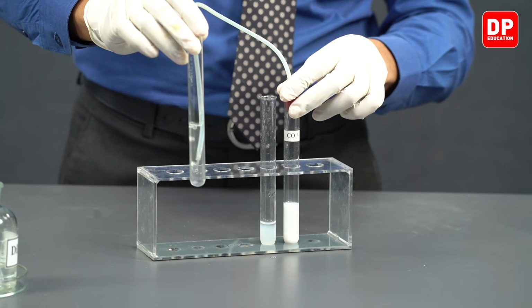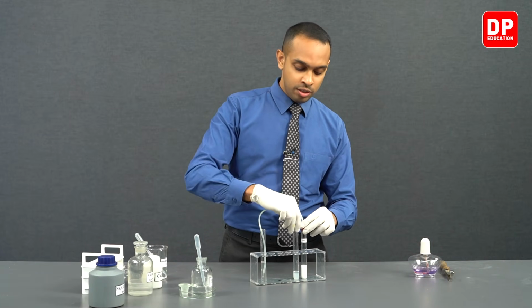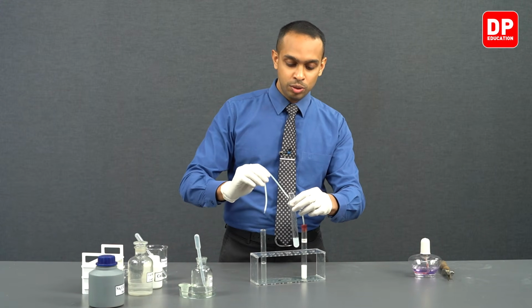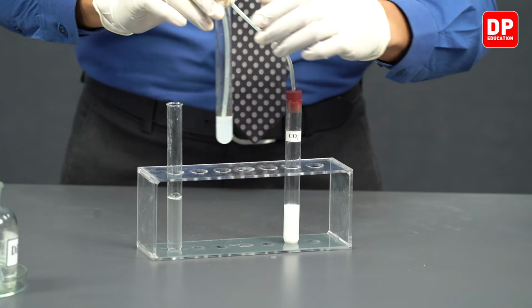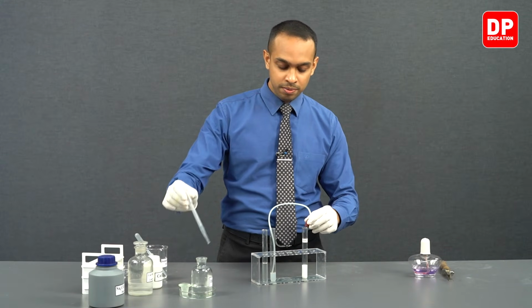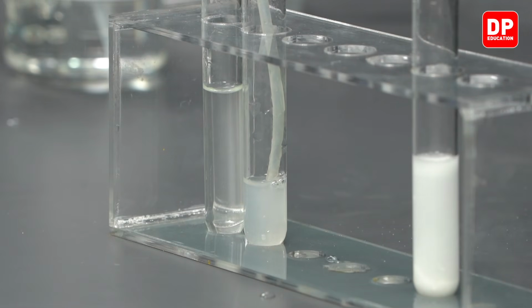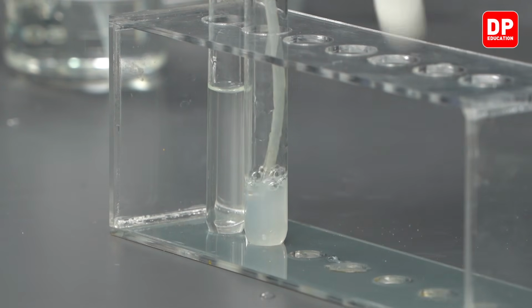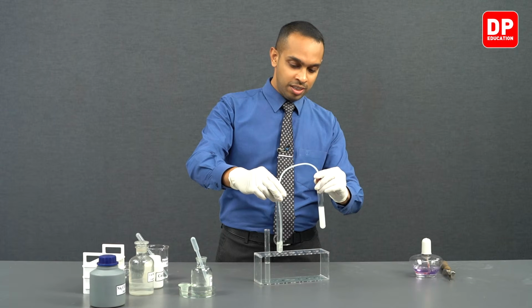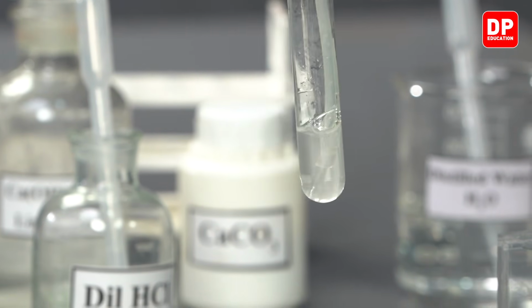We can very clearly see that this solution has turned clear as well. So we'll take the last portion also and attempt to make it clear as well. We'll add a little bit of HCl. We can see even that solution is turning clear little by little.